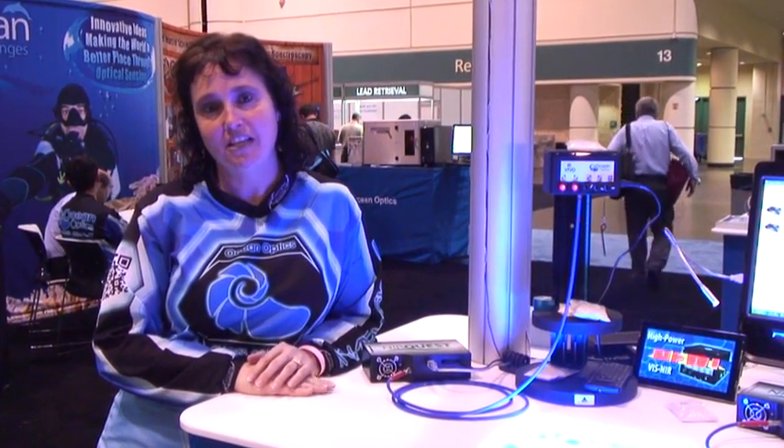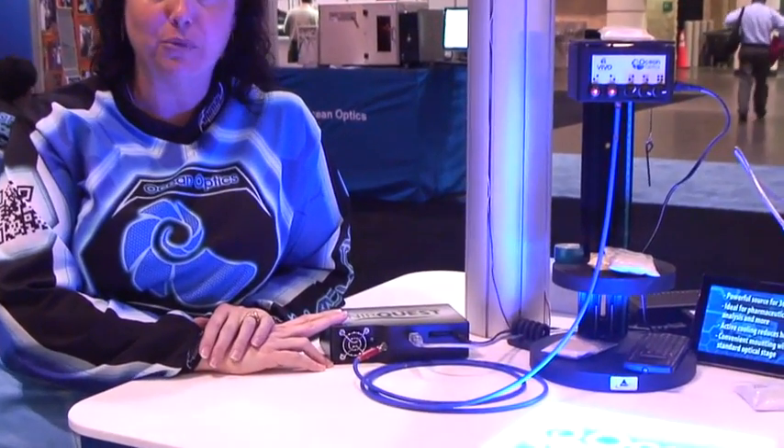Hi, I'm Yvette Matley, Senior Application Scientist at OceanOptics, and I'm here with our newest NIRQuest model. This is the NIRQuest 512-1.9.